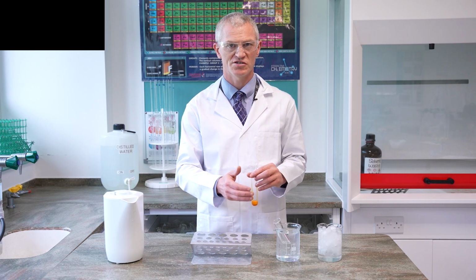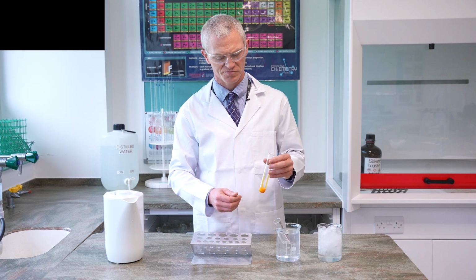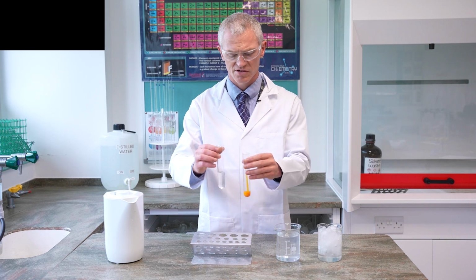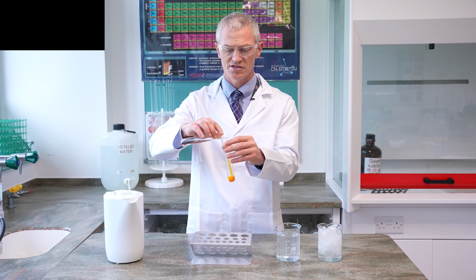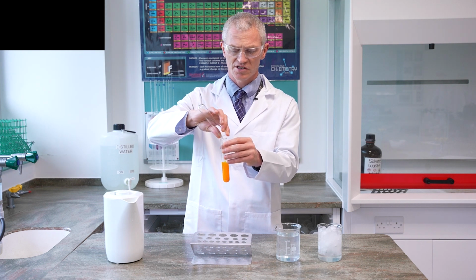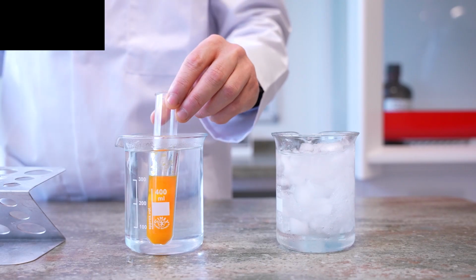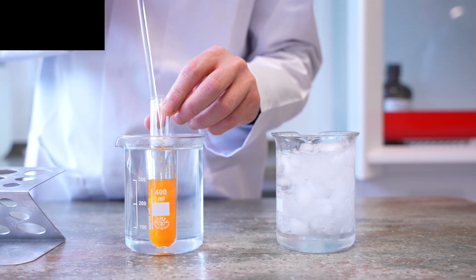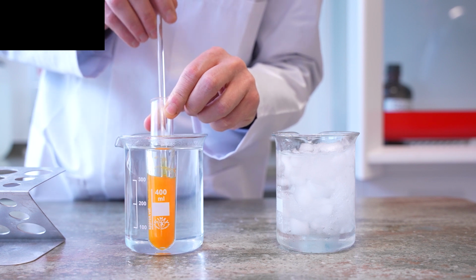So that's why we're just going to add all of this in here. What we're going to do is take the hot solvent and pour it into this derivative. Now we're going to put it into that freshly boiled hot water, and we're going to make sure we stir it. It's going to take a little bit just to warm up.